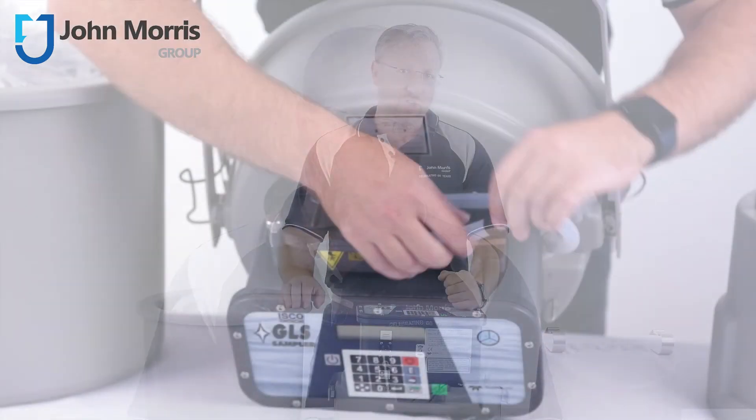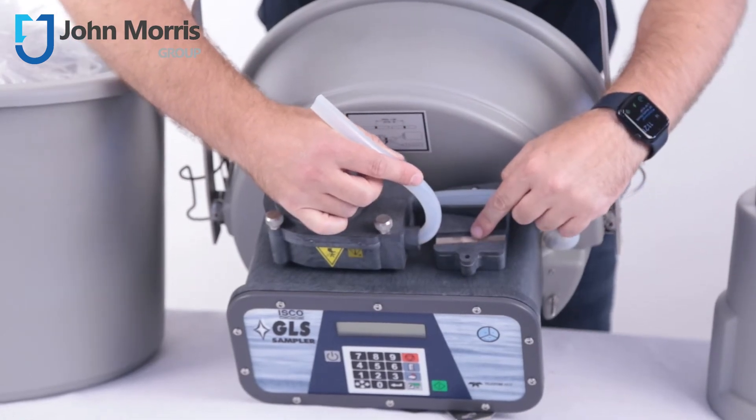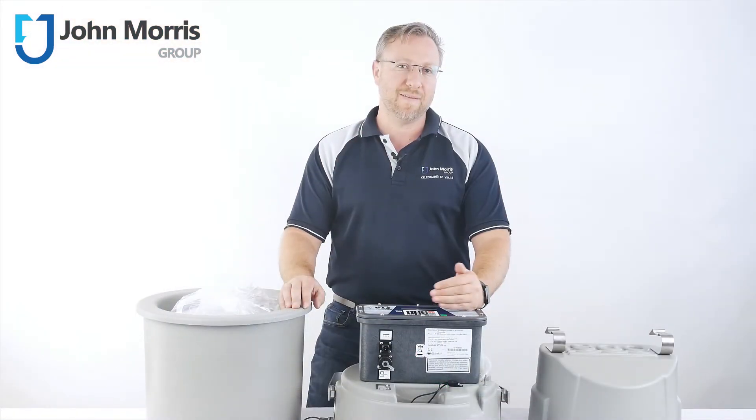Events are triggered via closed contact and normally come from either an external logger or flow meter of almost any brand. All ISCO units feature a liquid detector so they know when liquid is at the level of the pump, to ensure accurate volumes every time.